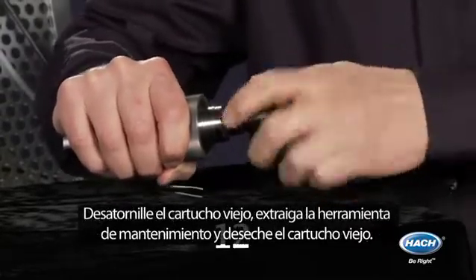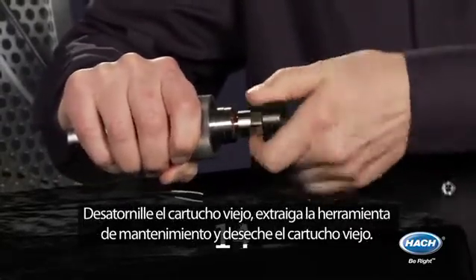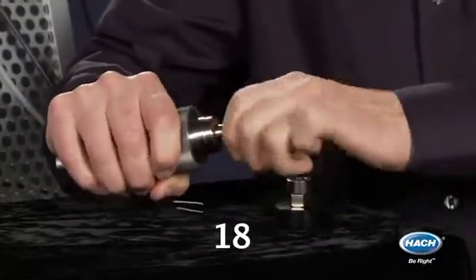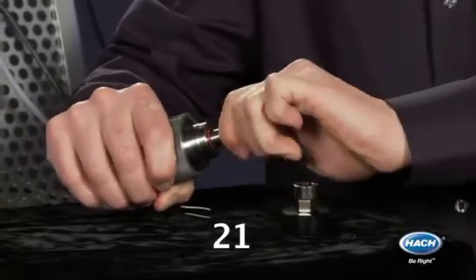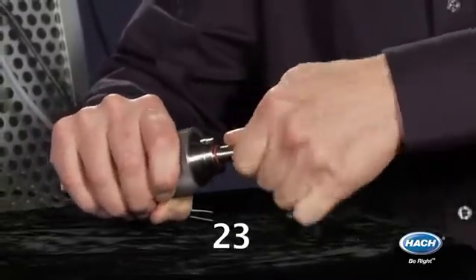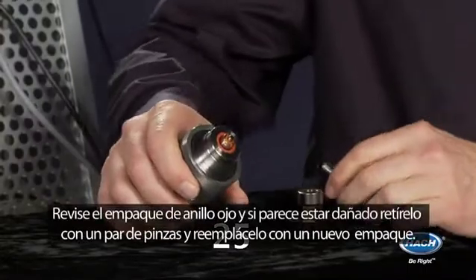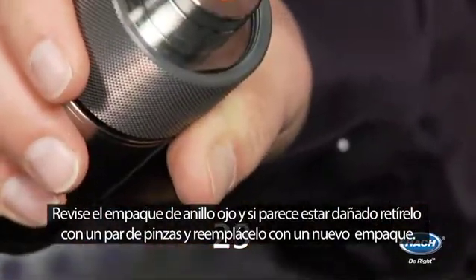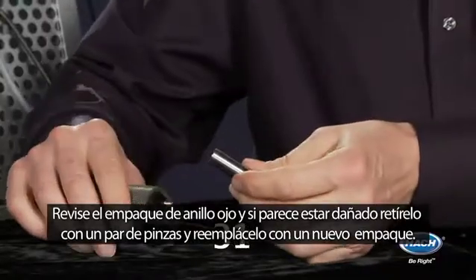Unscrew the old sensor spot and pull out the maintenance tool and discard the old sensor spot. Check the red o-ring and if it appears damaged, remove it with a pair of tweezers and replace it with a new o-ring.